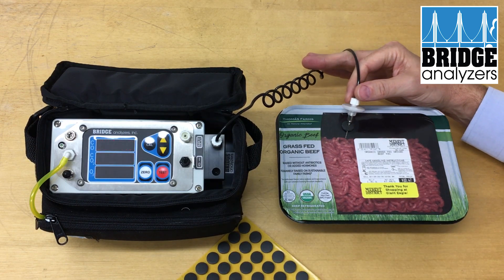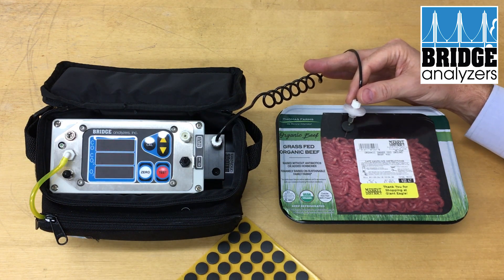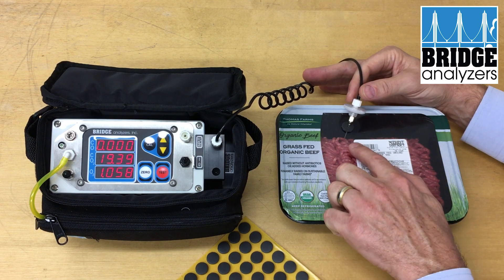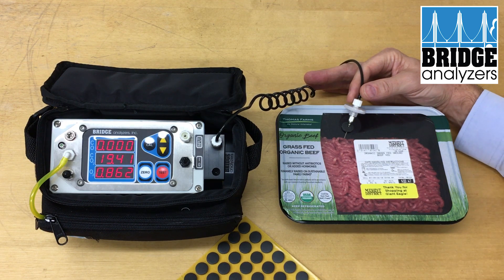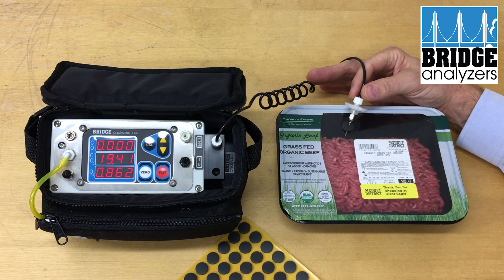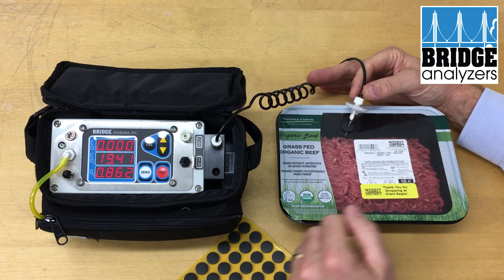When I hit the test button the display will blink and it will run for 15 seconds. During that 15 seconds we're drawing gas from the package through the analyzer. Here you'll see we're running at about 20% CO2 — maybe 19.4% — and the oxygen level is at about 0.86%, so less than 1%.